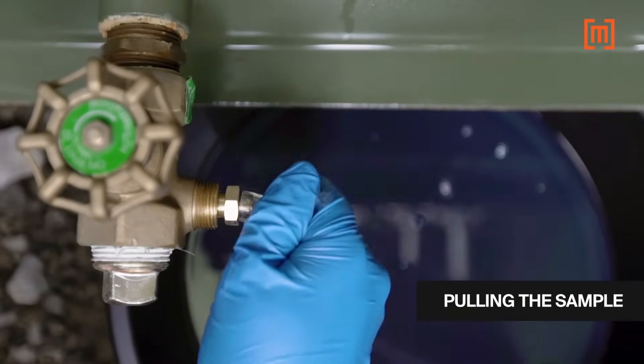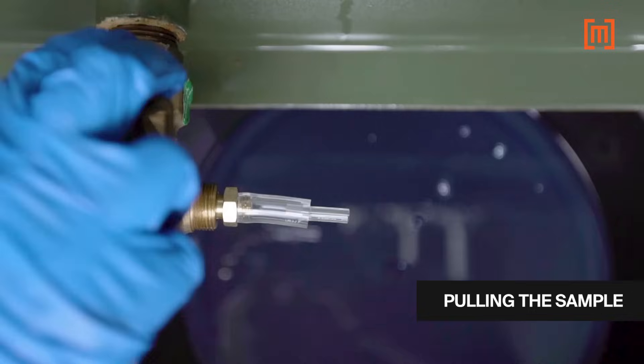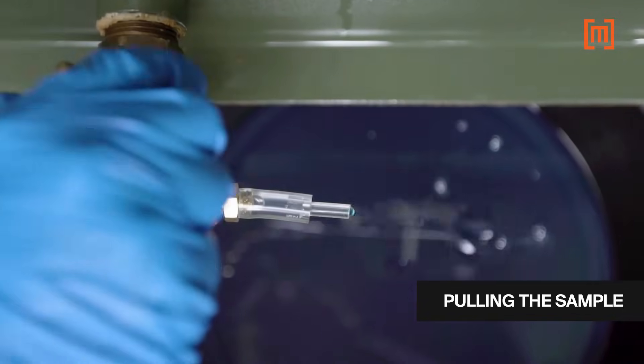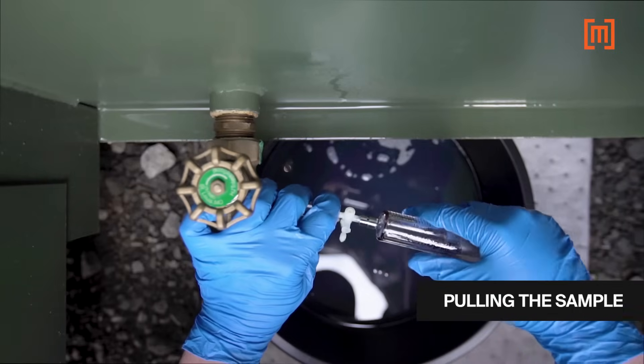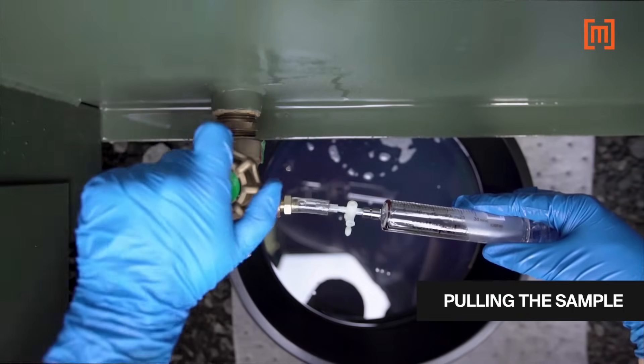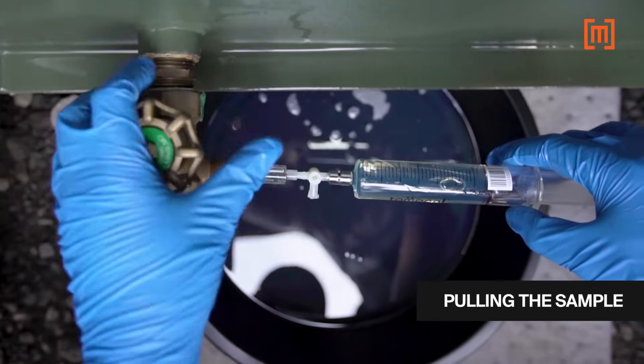In this example, a small piece of plastic hose is used as an adapter to connect the syringe to the sample port. The adapter is also purged before the sample is taken. The syringe is inserted into the hose, the drain valve opened, and the syringe is filled to a little bit over the 50 cc mark.